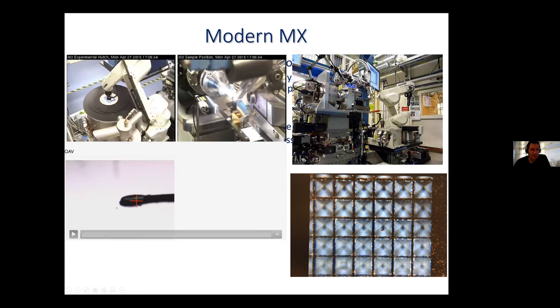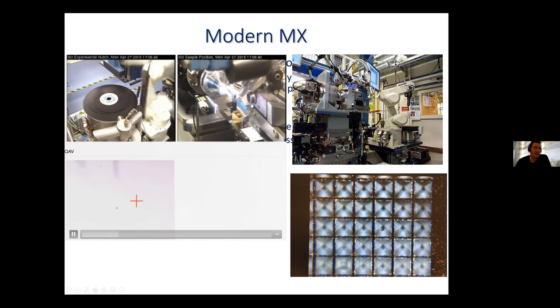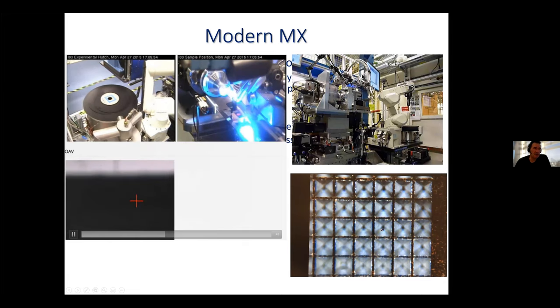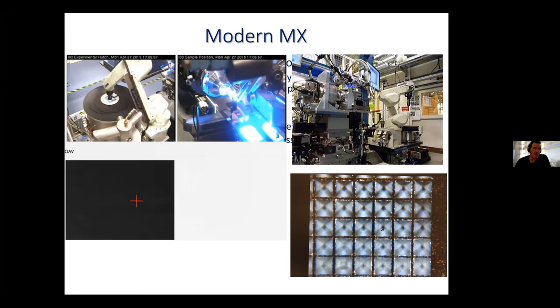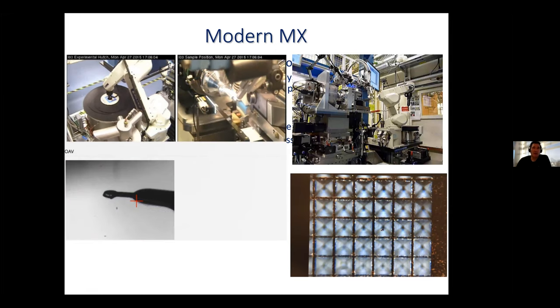And what you'll see, if you look at these three photographs, is the automatic taking of the sample out of the beam. The robot will then look in the dewar, the nitrogen container here, for a new sample, and then it'll mount it in the beam. It can change the sample in just a few seconds. So here we have the robot taking the sample off the diffractometer, putting it back in the dewar, moving to another position, picking a new sample out, putting it back in the beam, and then in a moment you'll see the new sample, ready to run. So there's the new sample mounted, and then the operator would line it up in the beam, check visually if it seems to be symmetric and a good sample, and then start to take the measurement. So that whole process typically just takes a few seconds.